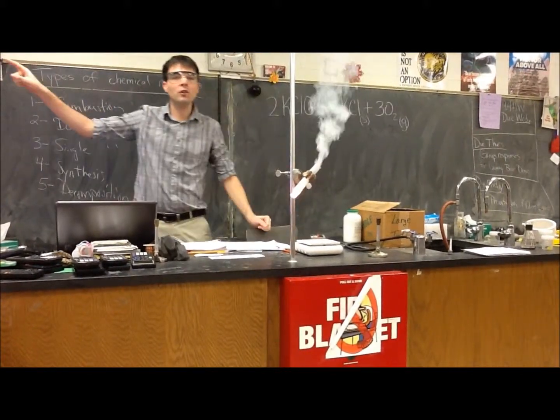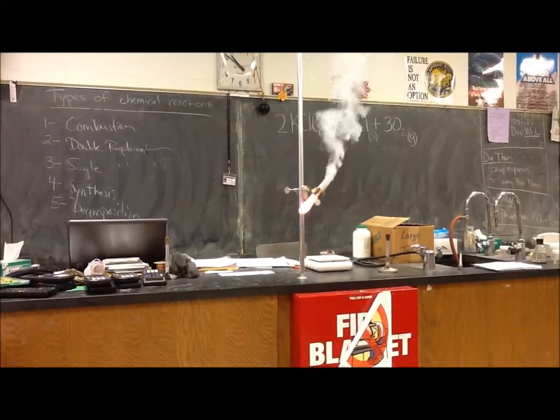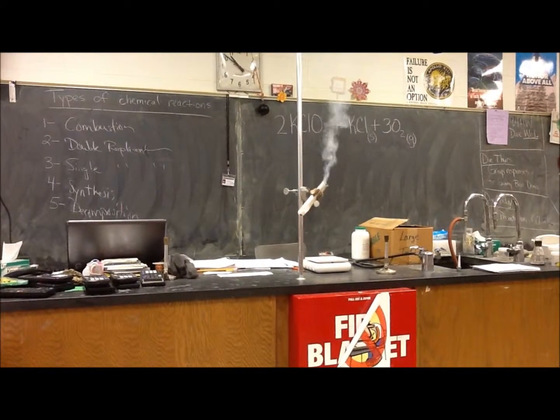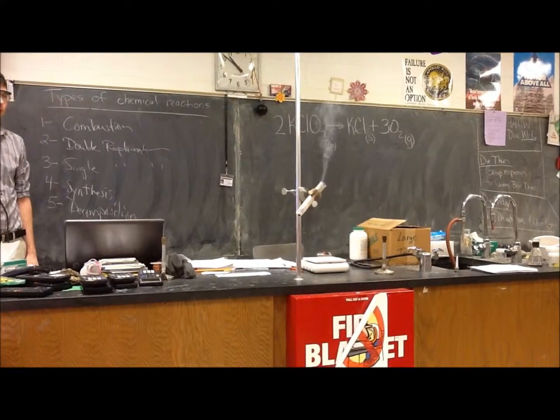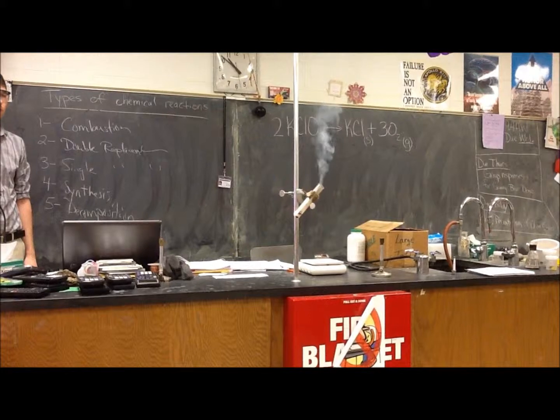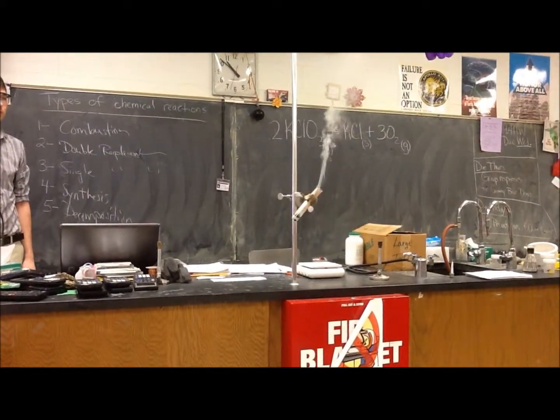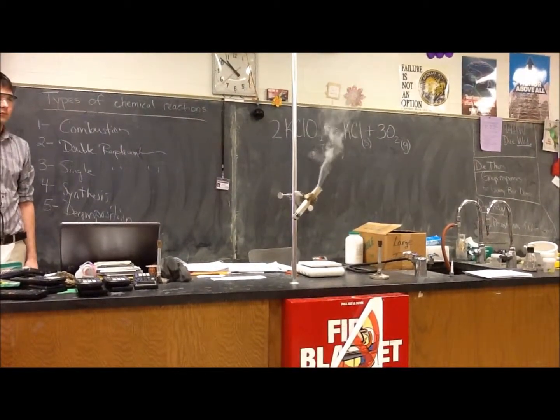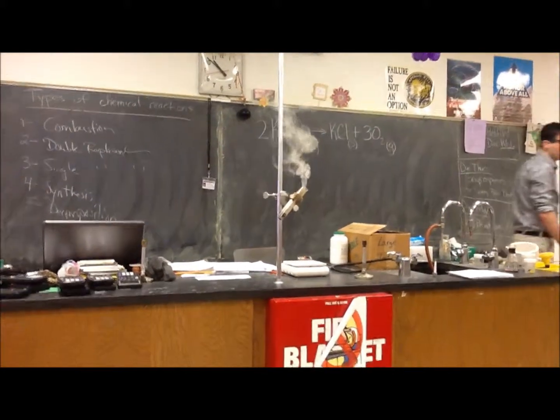I'm going to walk over here and turn on the fume hood because, as you can tell, there's a lot of gas coming out of the test tube. Seems to be finished.